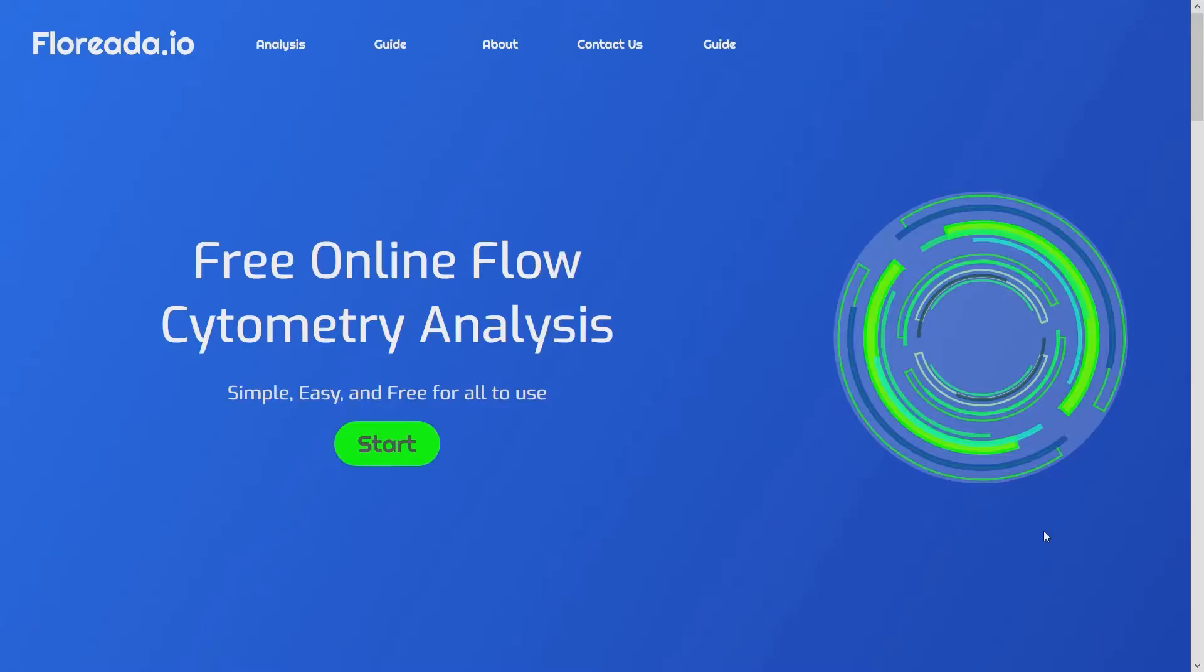Once you're on the home page, click the start button. That'll bring you over to the analysis page.